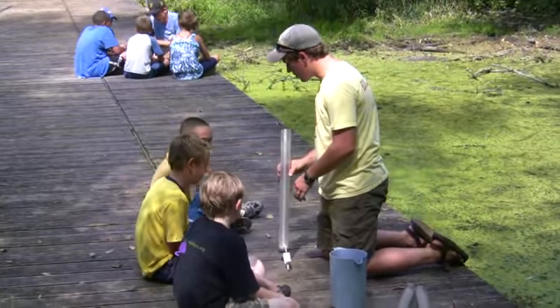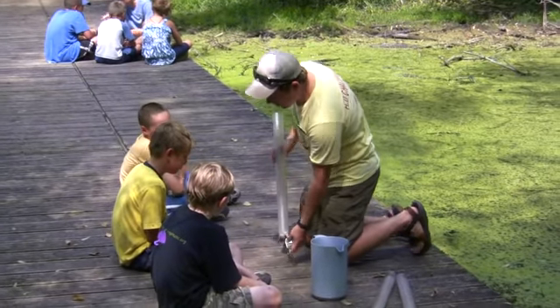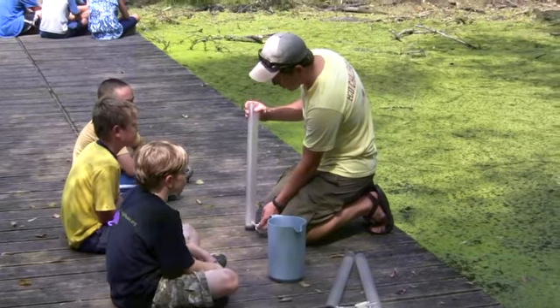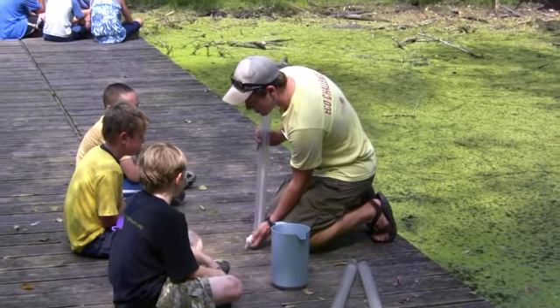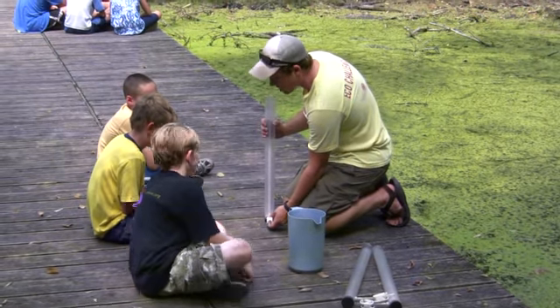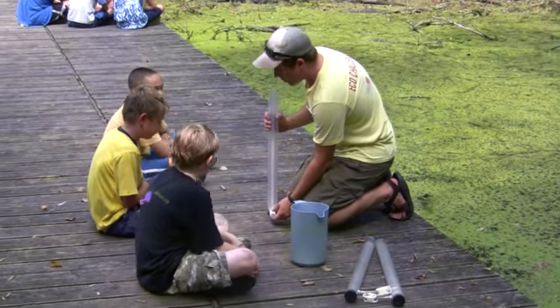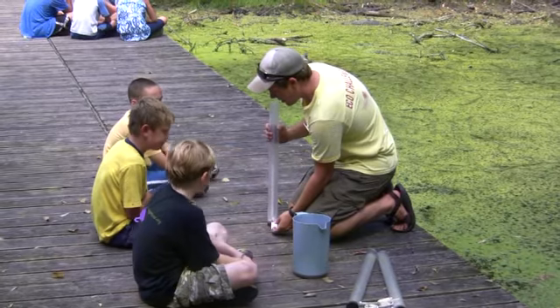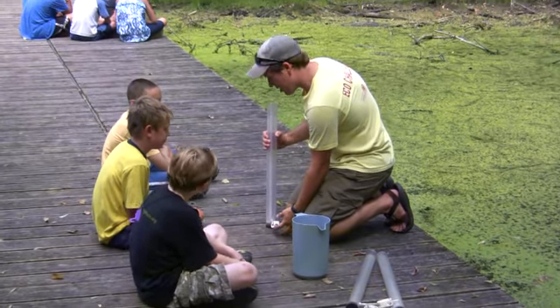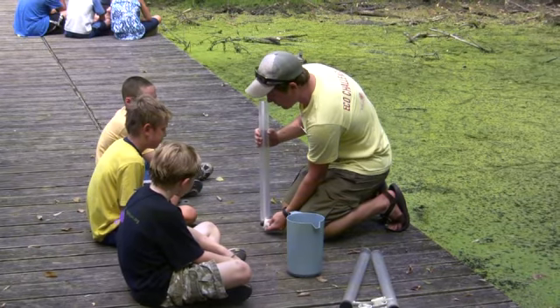Yep, so the way it's going to work is we're going to fill these up with water from Turtle Pond all the way to the top so it's overflowing just a little bit. And then there's this valve at the bottom that we could let out some water. So we're going to do this 3 times, and the way it's going to work is one person is going to be looking in and one person is going to be manning the valve.